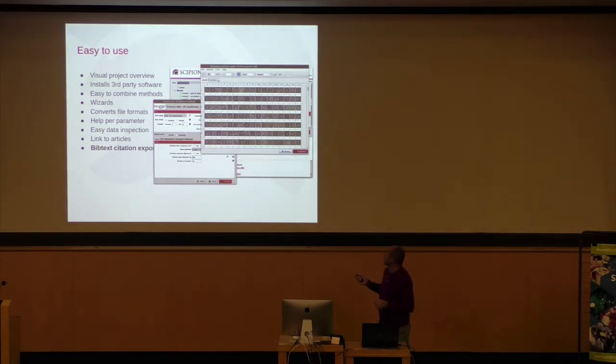And you can also visualize the files, or in this case, the set of particles. In a way, you can filter, you can zoom. This is provided by the plugins. But yeah, you can visualize the data inside Scipion easily.